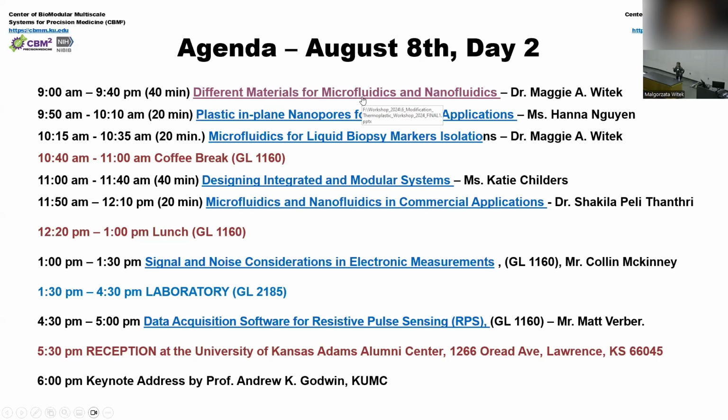Today we're going to address how to use it. I will start this day by telling you a little bit about how to prepare your surface of microfluidics or nanofluidics to accommodate your applications, whether that would be biocompatibility, or designing surface charge, for example, if you're doing microcapillary electrophoresis, or preparing a surface for processing biological samples and maybe how to prevent non-specific adsorption.